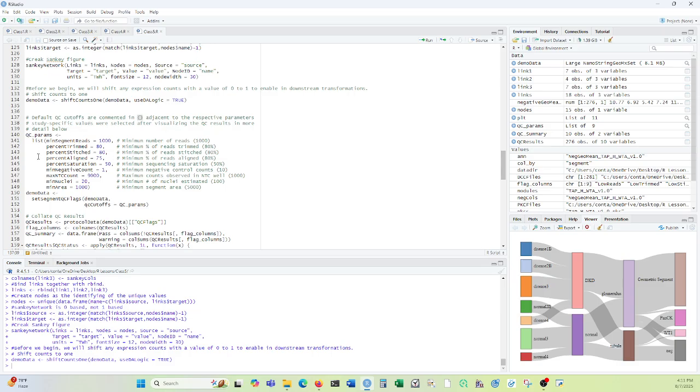So we're looking at various sequencing data, and these cutoffs are for what you expect from the data. So if it's below one of these figures or above one of these figures based on one of these settings, you can essentially eliminate that piece of data. So it's data cleaning of the sequence data.